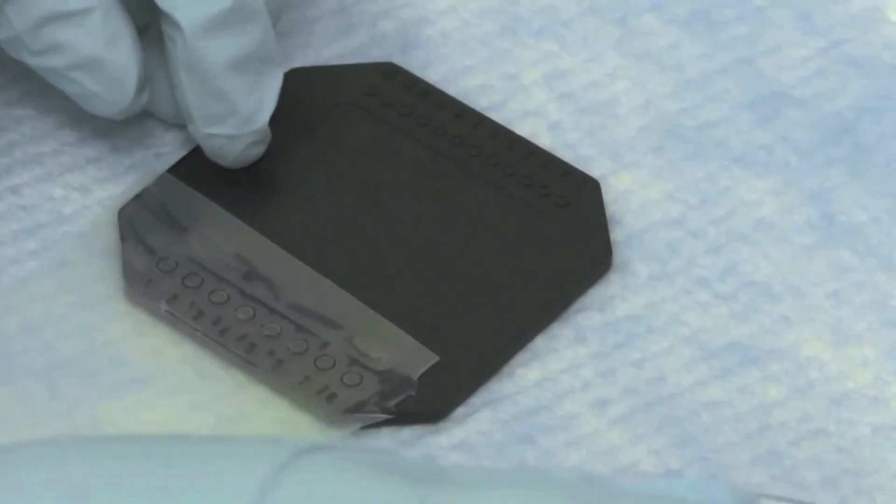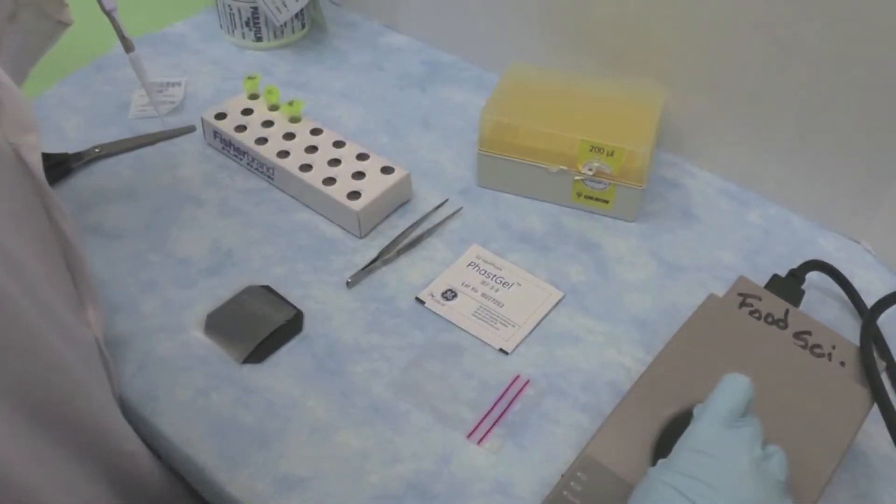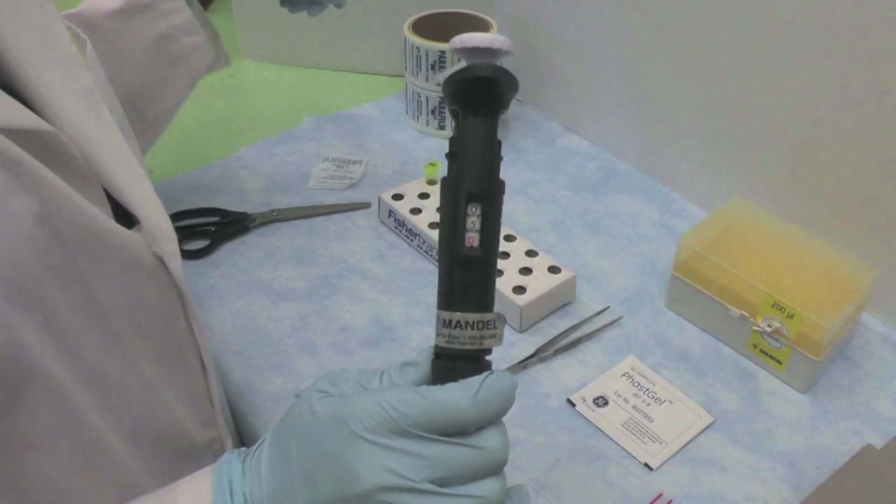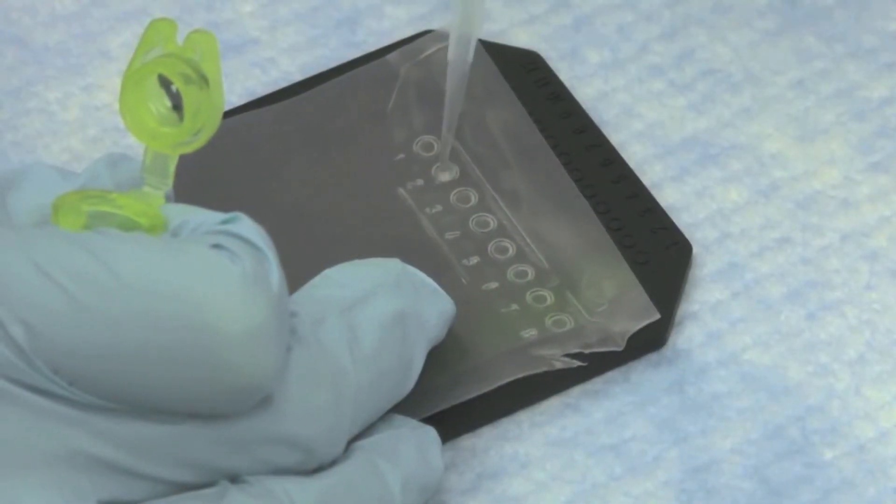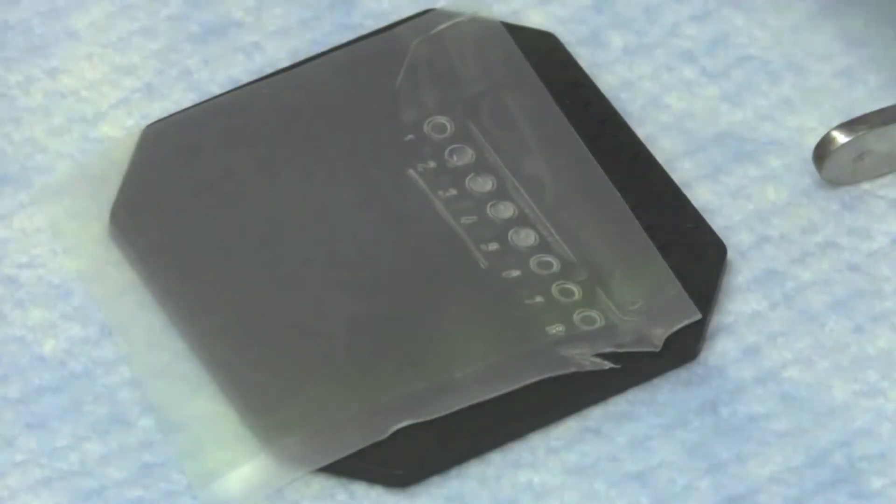Lift the protective cover on the parafilm and you can load samples onto the well. Quickly vortex the fish extracts then pipette 5 microliters of sample onto the well. The drop should form a nice dome shape without air bubbles.